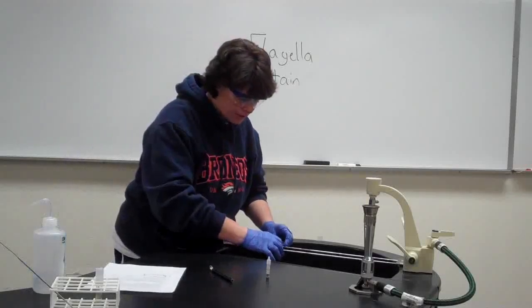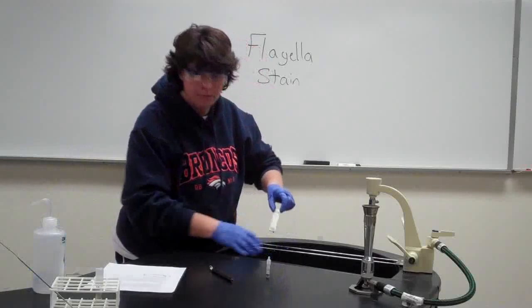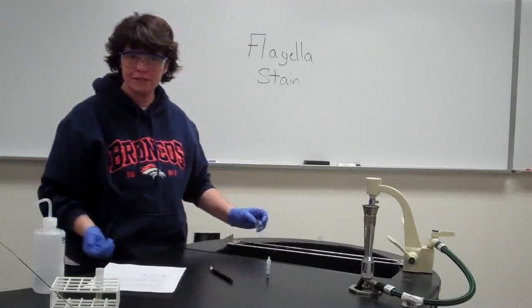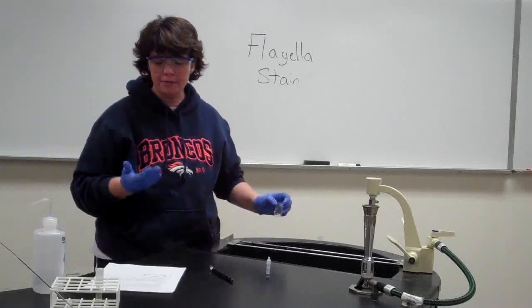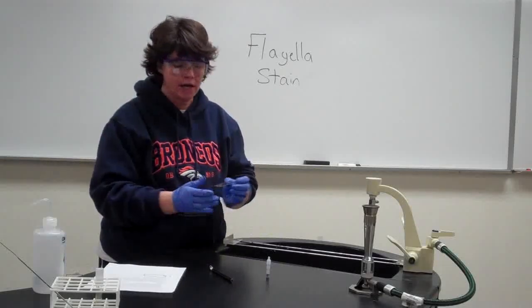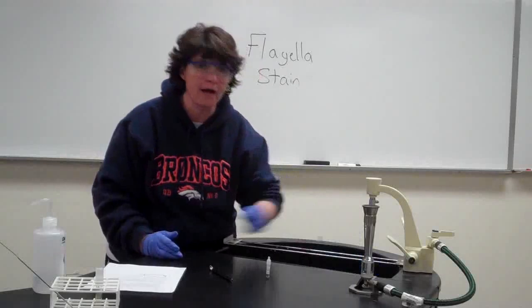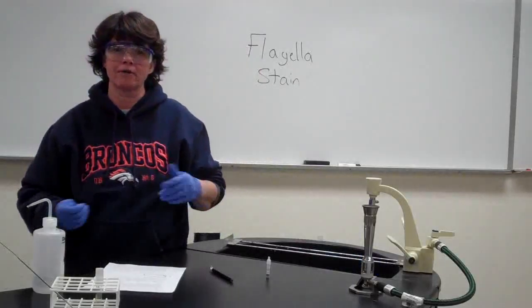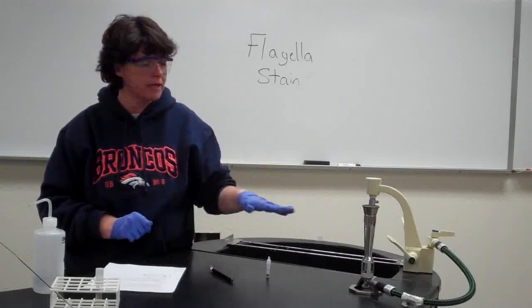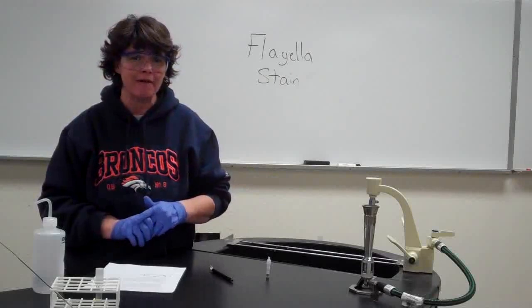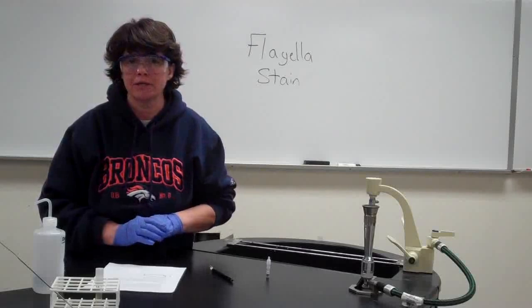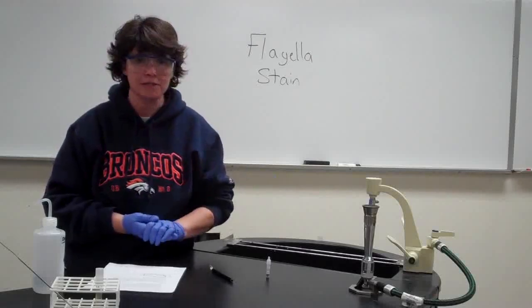When you're done, gently dump the excess off, then put the slide to the side and allow it to air dry completely. Do not blot it with a paper towel — just air dry. That may take a while, so start your next staining procedure while that's drying. Don't wait until the last minute to do the flagella stain because it could take 20 to 30 minutes to dry completely since you can't blot it.